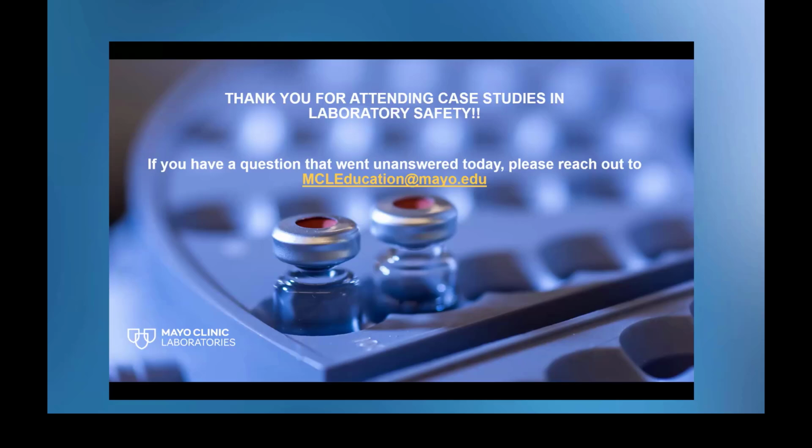All of that to say, here at Mayo, we have taken a risk-based approach. And so, depending on the work unit that you're in, we look at the risk of having that either in your pocket or in your hand or in certain places, recognizing that these are ubiquitous. And my vote would be to get them completely out of the laboratory. And I recognize that not all laboratories are the same. So it's a challenge for sure.